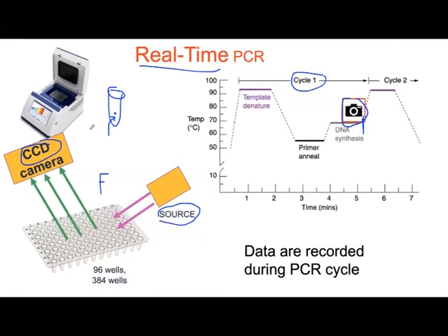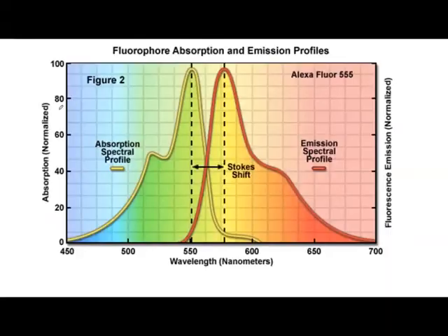So this machine is modified, and it looks different because you need to measure fluorescence. In this slide, I'm describing for people who use fluorescence in flow cytometry, immunofluorescence, or even ELISA, that you need to excite the molecule with a lamp, with light, and that molecule will absorb and emit a new wavelength with less energy, and this is called a Stokes shift.